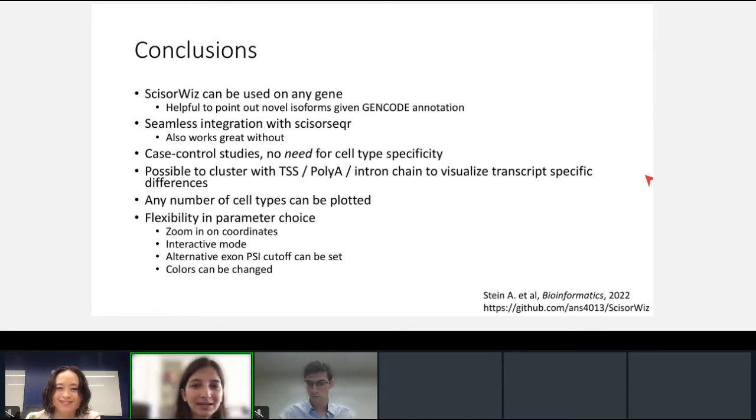With that, I'm happy to take any questions. Please check out Alex's publication that came out in Bioinformatics earlier this year, and I can also drop the GitHub link in the chat, which has more documentation and the exact parameters you can include when you are trying to run the tool. Thanks.